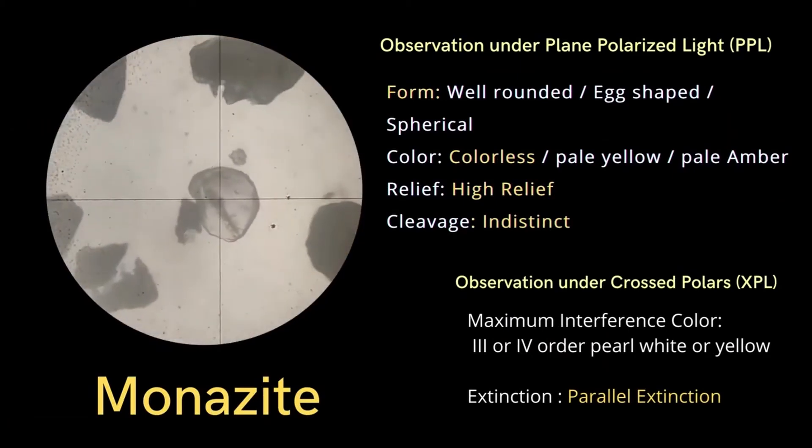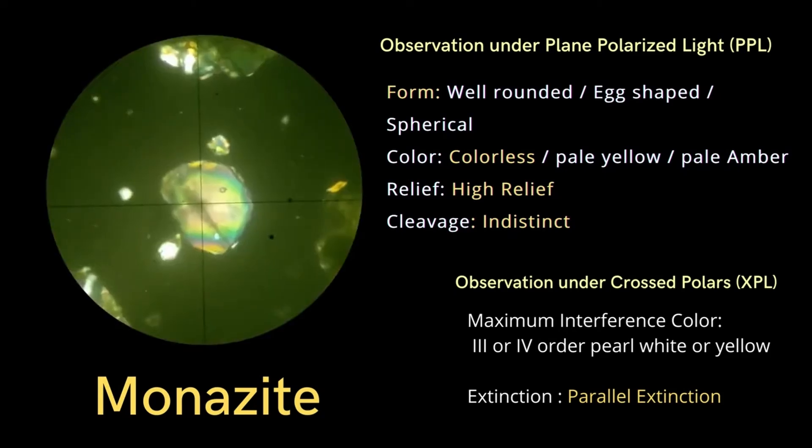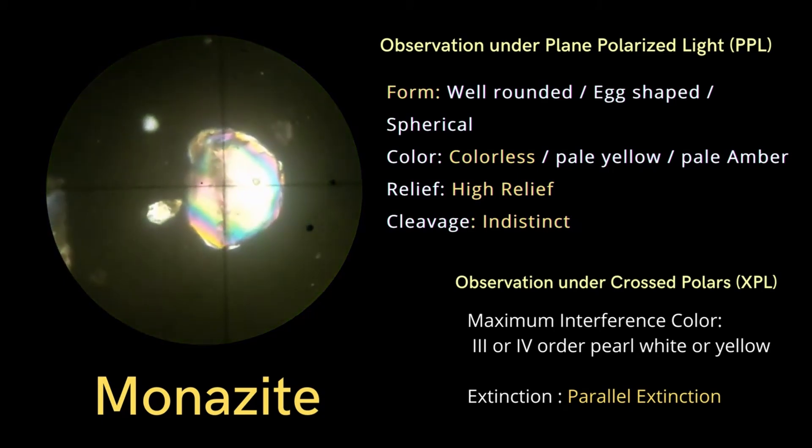The cleavage is generally indistinct. Switching to crossed polars, Monazite shows a maximum interference colour in the third or fourth order, typically appearing as pearl white or yellow.